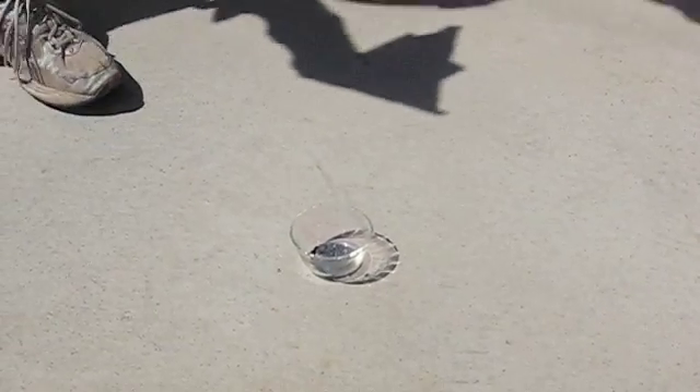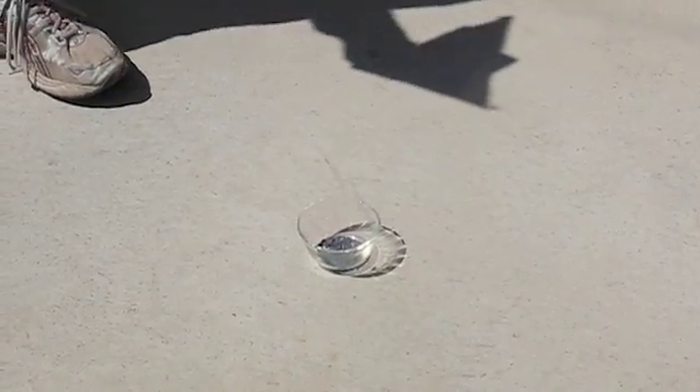And here I have iodine — elemental iodine crystals. You can see it's a purplish-greyish solid.